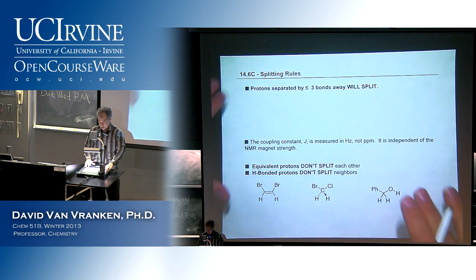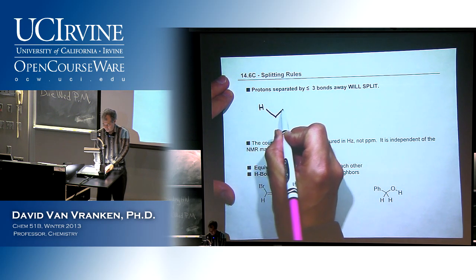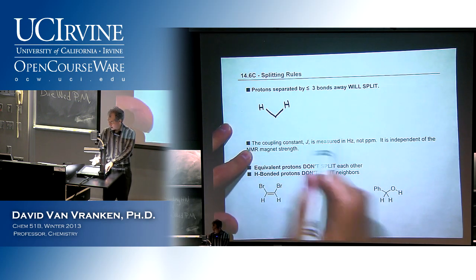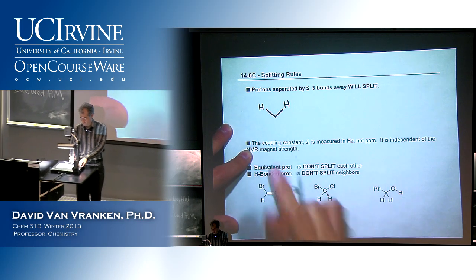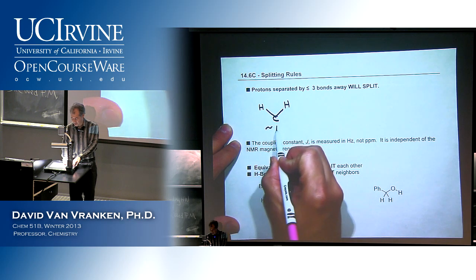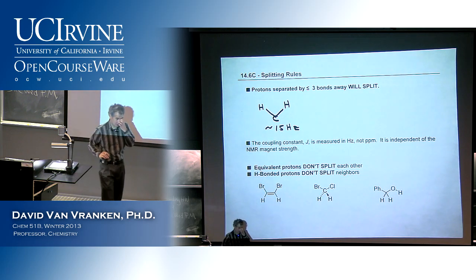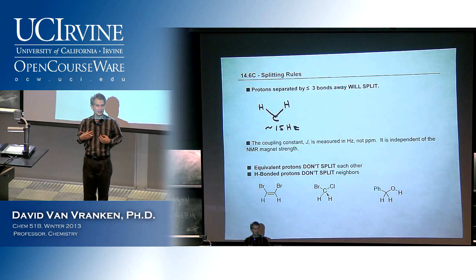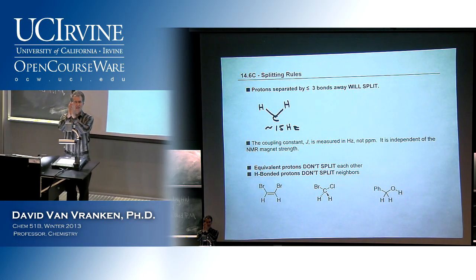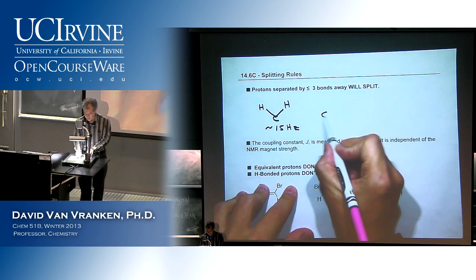Okay, so let's go ahead and talk about various common arrangements of protons. When are protons close enough to affect each other? So I'll give you three coupling scenarios. So one common coupling scenario is two protons on the same carbon. And these couplings are typically around 15 Hertz, but as I just told you, it depends on the angle between those two protons. So in other words, that looks like a big coupling. It's a coupling where you can see right through those peaks on the NMR spectrum. Sometimes the little peaks are so close, you can't even tell that there's two peaks there. It's hard to tell. Okay, that's one coupling scenario where they're close enough to couple.